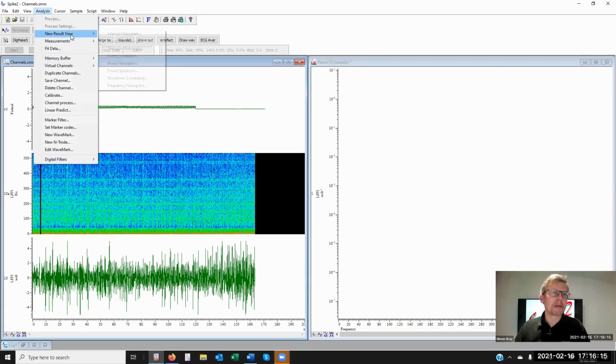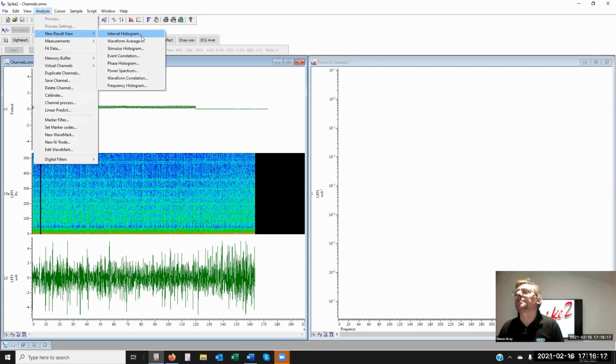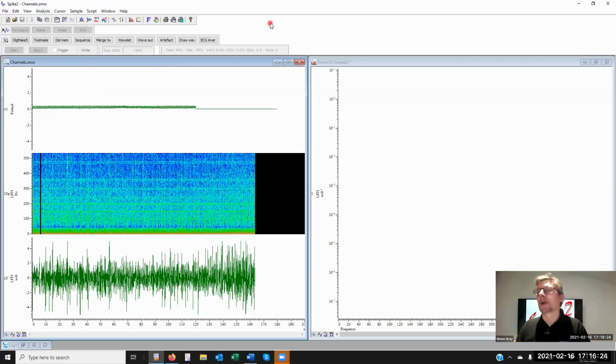So these are the older interval histograms, PSTHs, averages, etc. Okay, amongst other things. I'm afraid Spike2 is a huge program. There's an awful lot to talk about, and many of these functions, in fact, the majority work together. And so it's rather difficult to give you sometimes a very clear real-world usage without combining a lot of things.